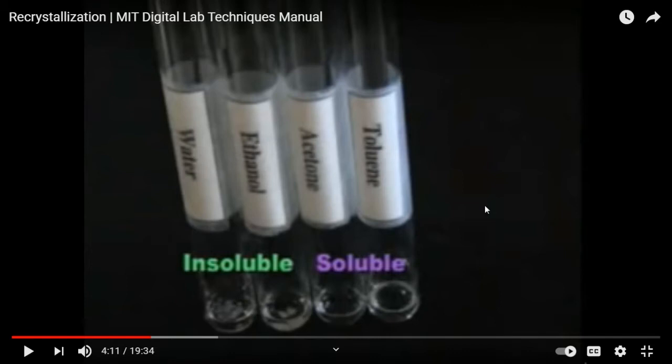Then we have to dissolve anyway in the later stage of the experiment, right? Then what are you going to do? Easily, you can add more solvent to dissolve more crystal, as far as it dissolves, at least partially, right? You can add more solvent. Common sense. Okay? You understand. Go ahead.